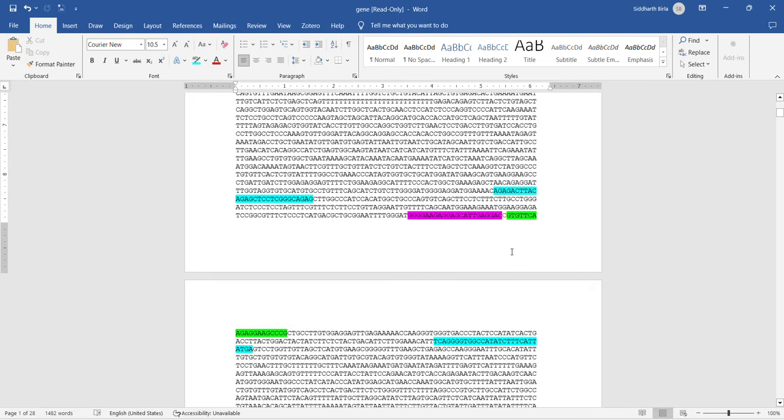Now you need to check the specificity, how specific this is, because if it is not specific, the primers will bind here and there and you will not get proper results in your PCR, especially when you run the gel, you will be getting several bands. So I'll make a separate video on how to check the specificity of the primers.